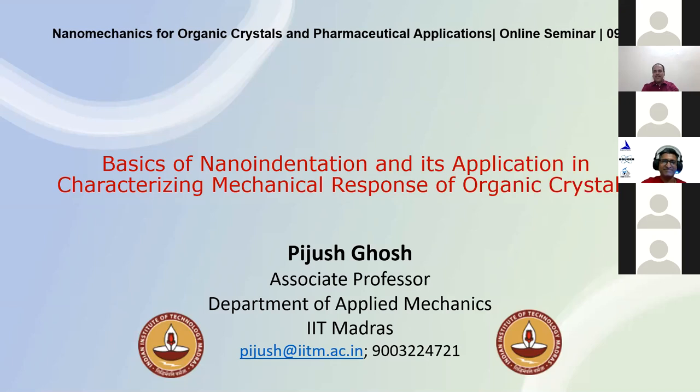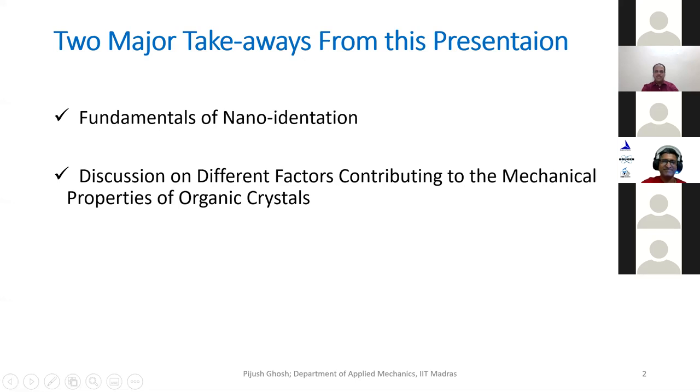So I will quickly go to the major takeaways from this presentation. Actually, my job is very simple. I have only two takeaways: to talk a little bit about the fundamentals of nanoindentation, and I know that this audience is primarily from the chemistry or pharmaceutical background, so I will not go into the details of the mechanics aspect, but I will still try to give you a feel about the fundamentals of nanoindentation, and then some discussion on different factors contributing to the mechanical properties of the organic crystals. That's the responsibility I have. As you see, it's only 2 points.